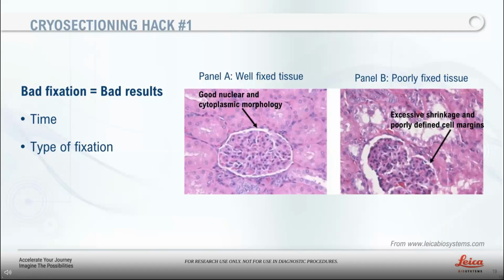There are different approaches for fixation. The most commonly used are 4% formaldehyde for fluorescent light microscopy or a glutaraldehyde solution for electron microscopy. Other techniques have been introduced to the field, like high-pressure freezing, which is a very interesting fixation protocol, but I have not tried it myself.